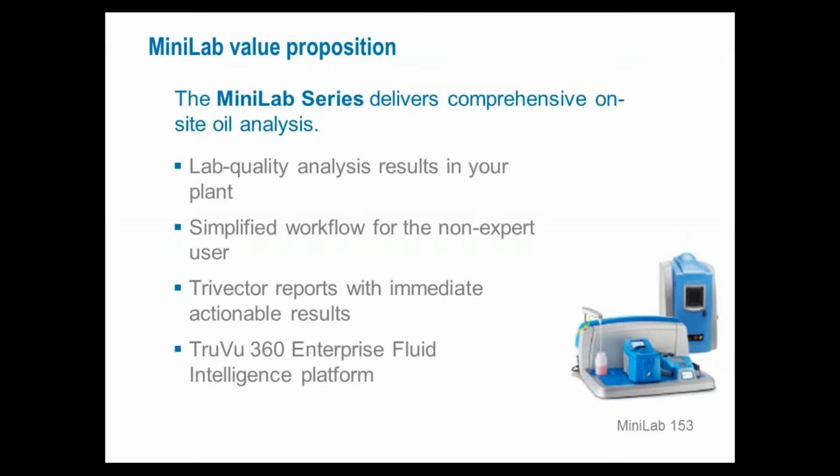And we provide tri-vector reports which give you not just the analytical results, but immediately actionable information like, here's a recommended action to take place for this particular alarm condition on this particular component. We'll circle back to that a little. These three bullets, they've been the mainstay of the Minilab series offer over the last 5 years.